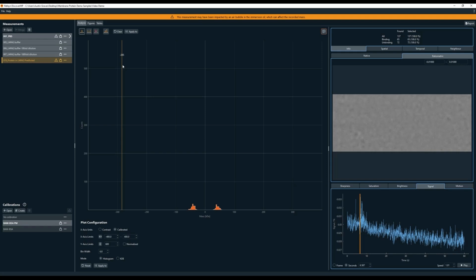You can imagine that a larger protein complex is going to be easier to distinguish from background signal than a smaller one. Now, anytime we run a sample, it's not unusual to see some background signal from our buffer. This mostly is going to appear as two mirror peaks on either side of zero like this. This movie of PBS shows the minimal background signal we can expect when running a clean buffer.